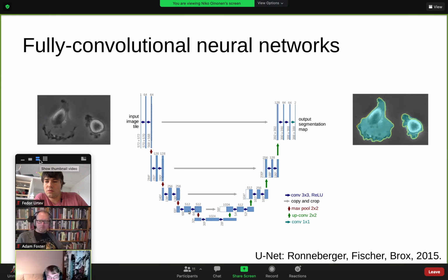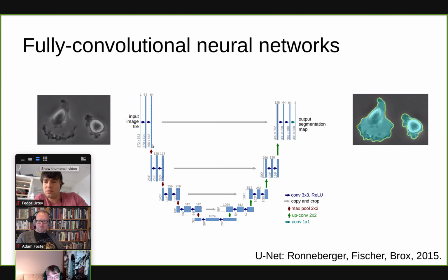So it does a similar thing as the classification networks, in that it reduces gradually the size of the features in the network, but then it actually goes back up, so that it uses some kind of upsampling and more convolutional layers to put the image back into the size that it came in at.